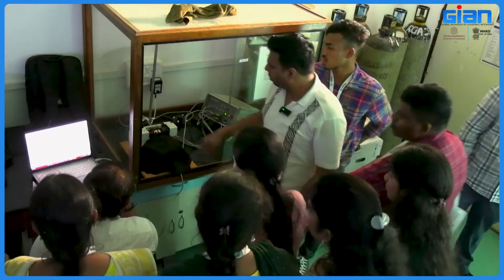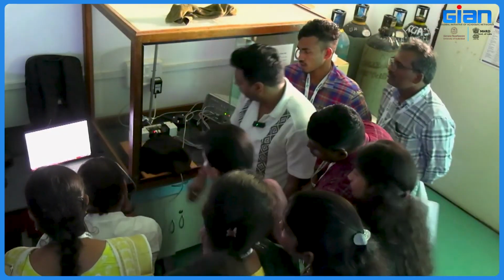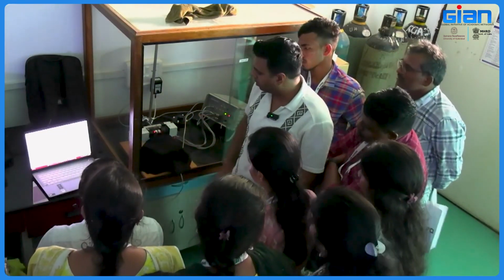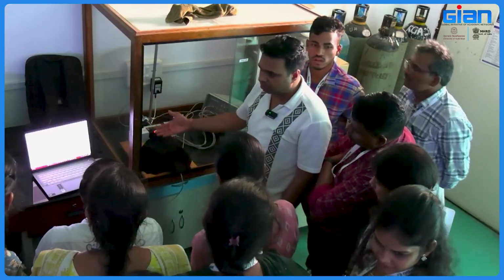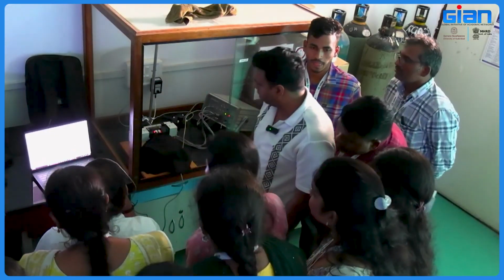Yeah. So now the actinic light running is this one, 48. Okay, so you see a red light will flash. That will be your saturating pulse. So now the power increased. The increased power intensity is displayed here, 61.